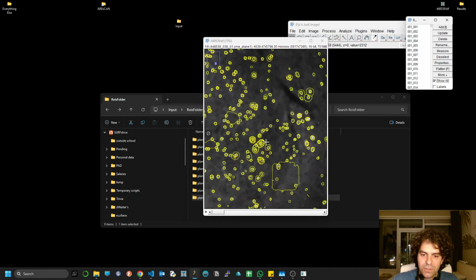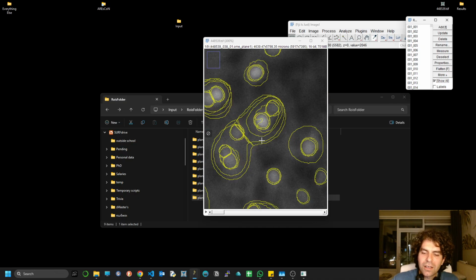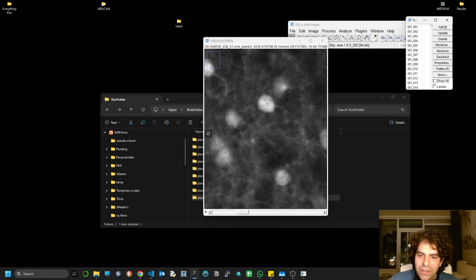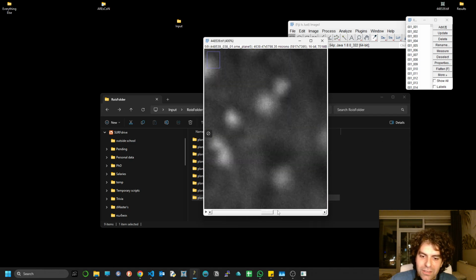And you can also see what the problem is. So you will be wondering why in the world do we have all these observations across clearly apparent neurons? Well, the reason is that when you start going away from the plane with the clear ones, things start to get messy, right?